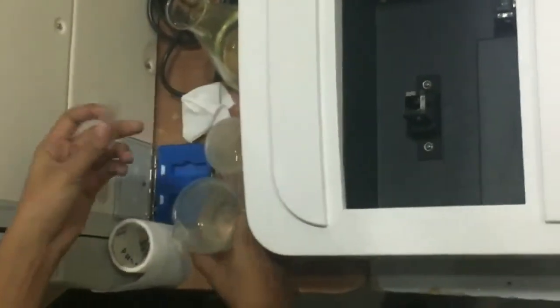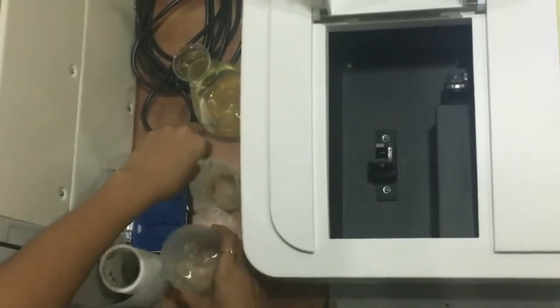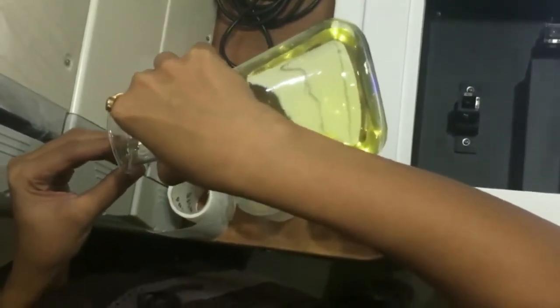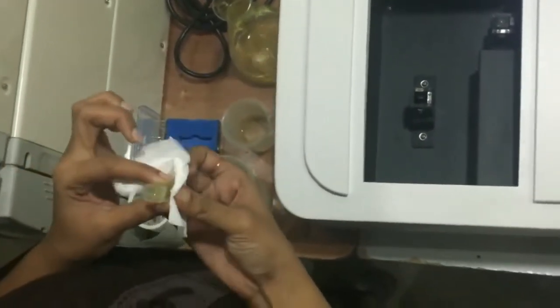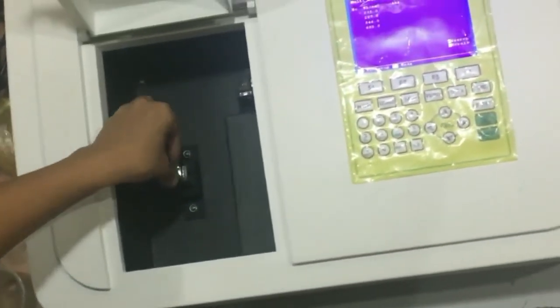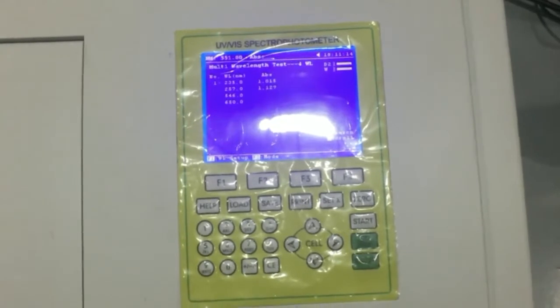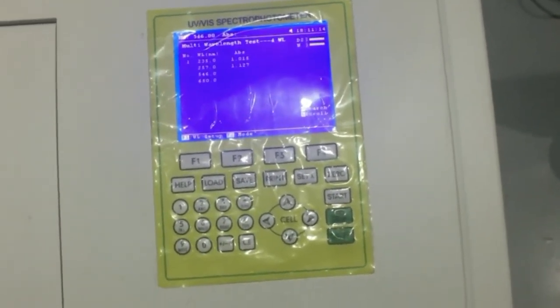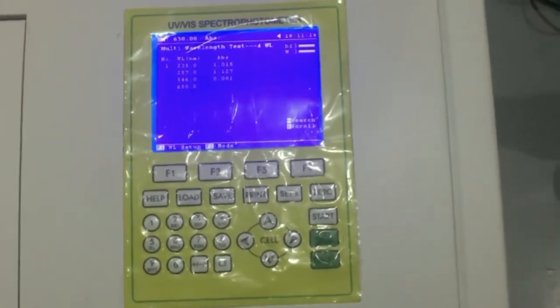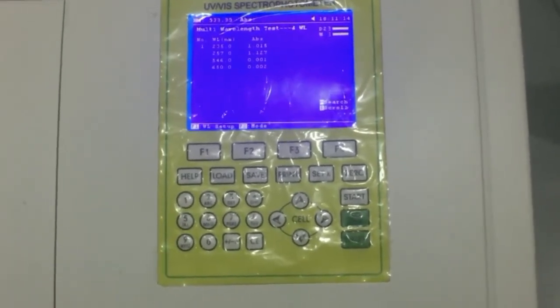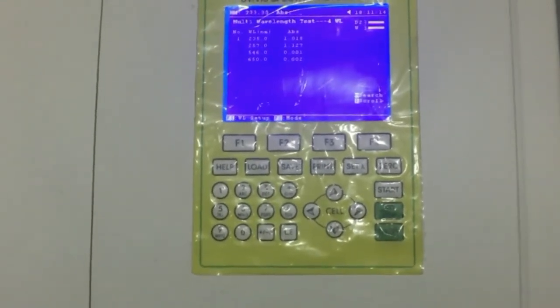The alarm indicates the completion of auto-zero. After that, place the sample in the sample cuvette port. Try to keep the cuvette scratch- and fingerprint-free. For absorbance measurement, press start. It will give results simultaneously at different wavelengths: at 235 nm the result is 1.015; at 257 nm it is 1.127; at 546 nm it is 0.001; and at 650 nm it is 0.002 absorbance.